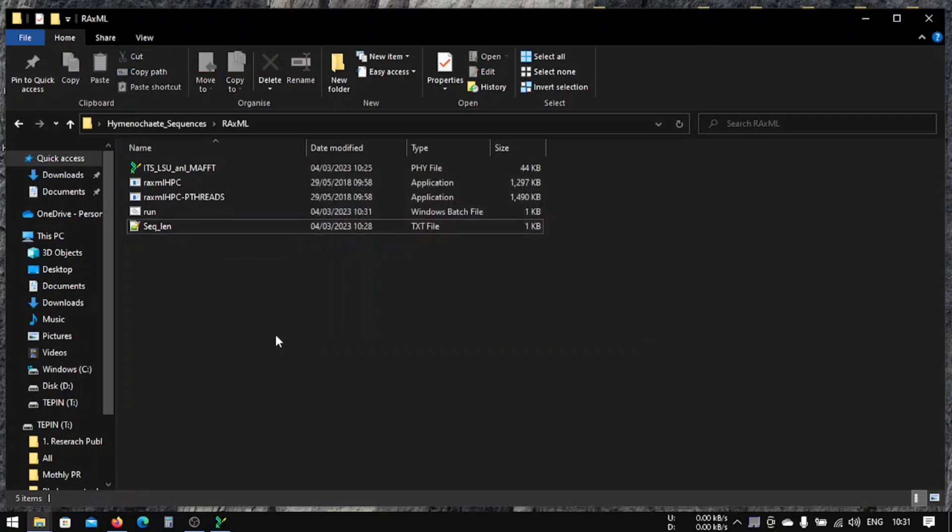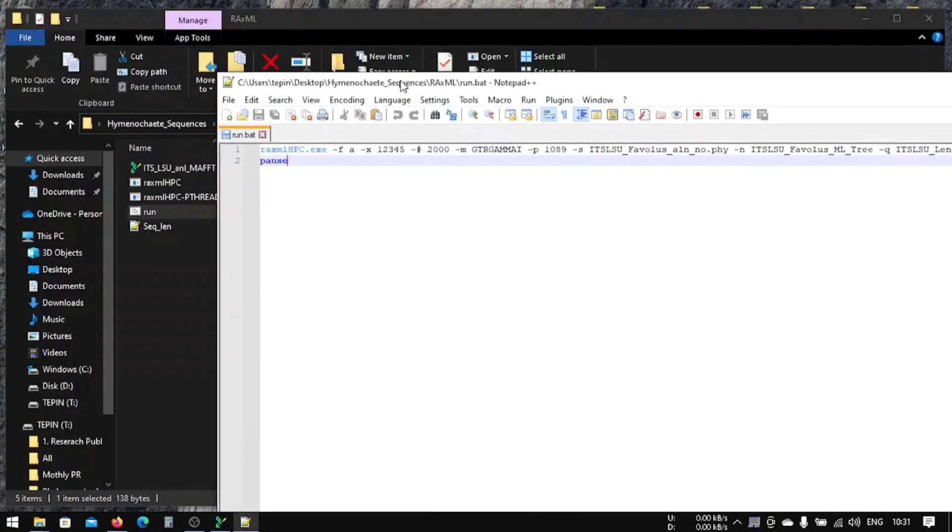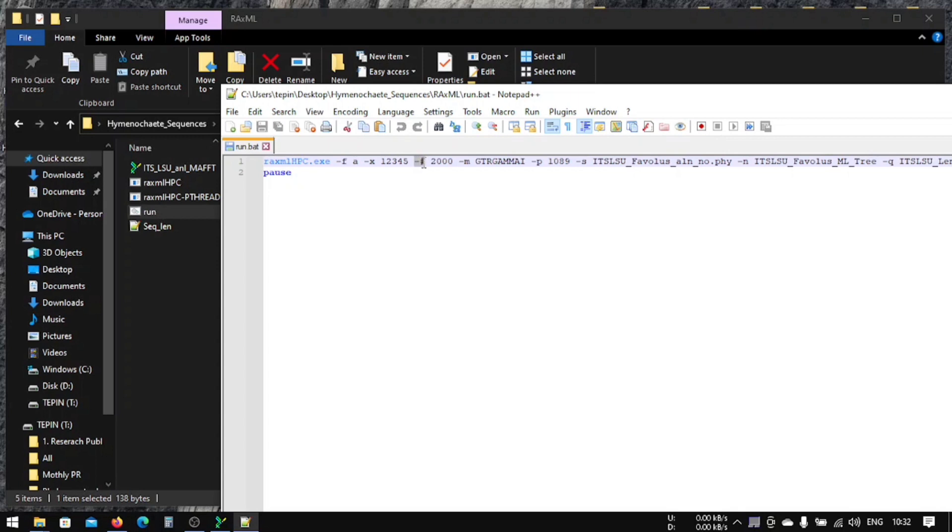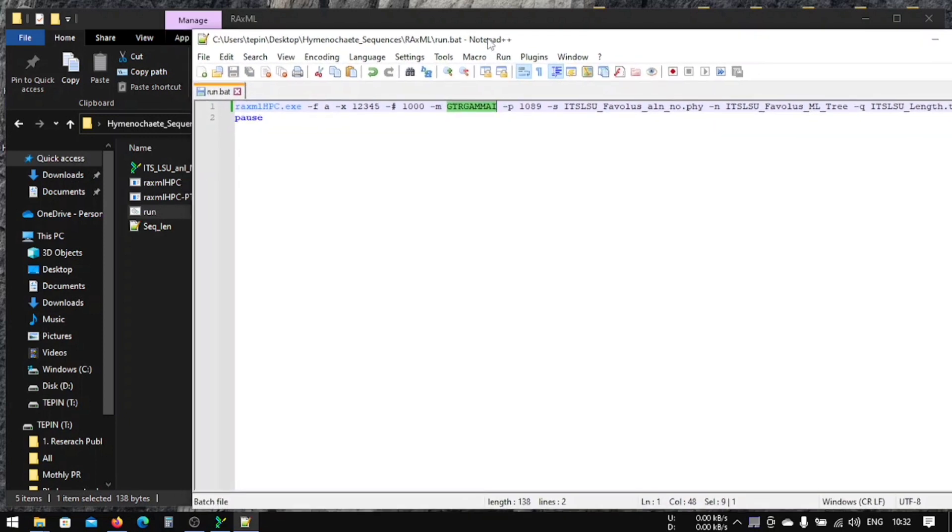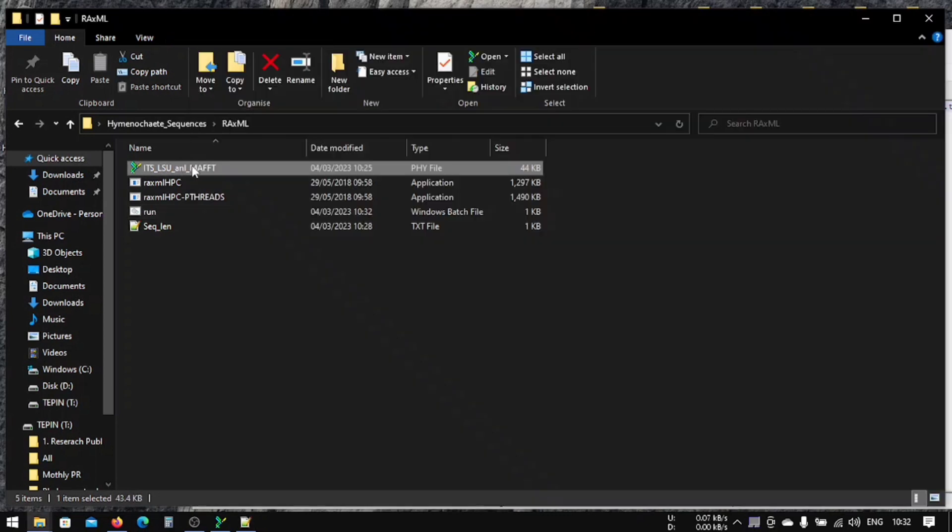After this, you have to edit this and put some things. For example, -f equals A, you have to put this, and -x equals, you can put random number here. This is your bootstrap value, -# back. Usually keep this bootstrap value to 1000. This is the model that we have talked about from jModelTest, so GTR+GAMMA+I. This p-value we will put it from jModelTest. This is the name of our input file, so just copy it here and paste it here .phy.